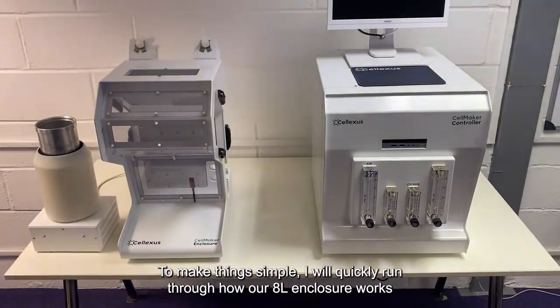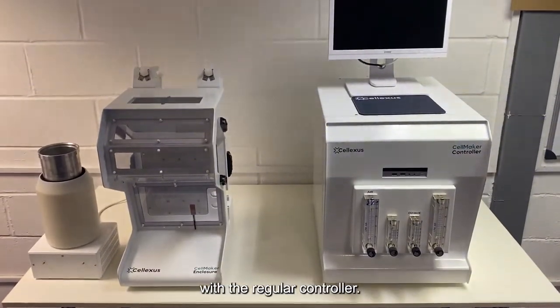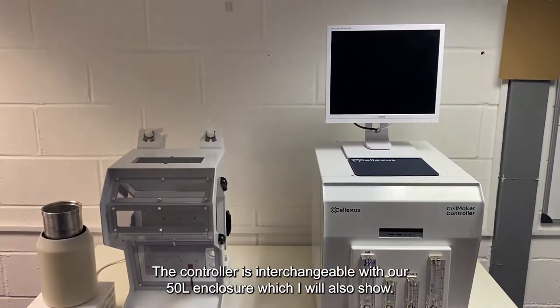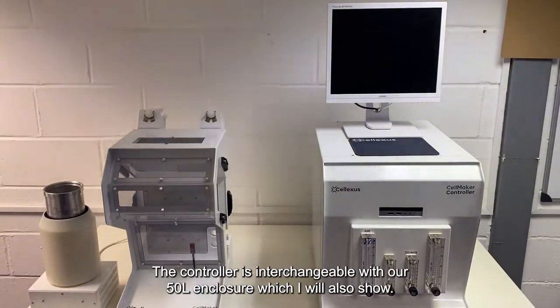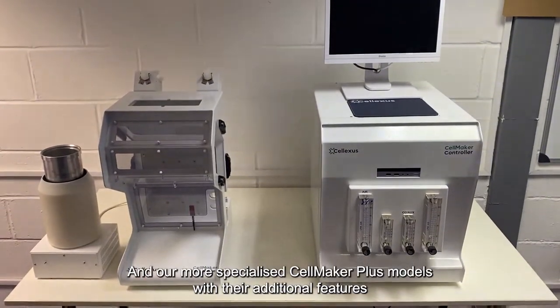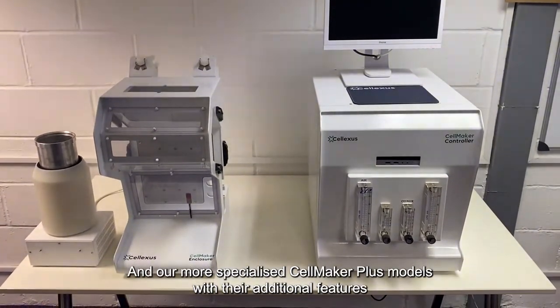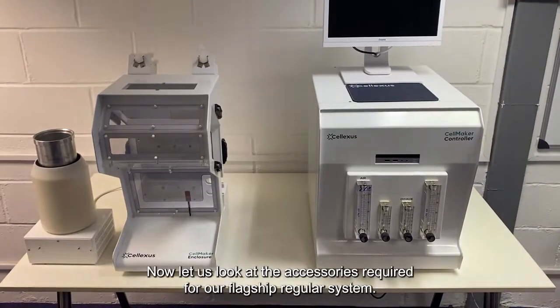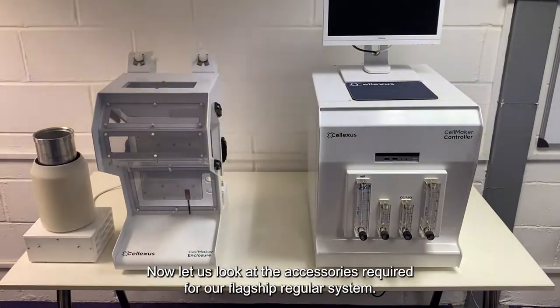To make things simple, I will quickly run through how our 8 litre enclosure works with the regular controller. The controller is interchangeable with our 50 litre enclosure, which I'll show also, and our more specialized CellMaker Plus models with their additional features will be discussed after. Now, let's look at the accessories required for our flagship regular system.